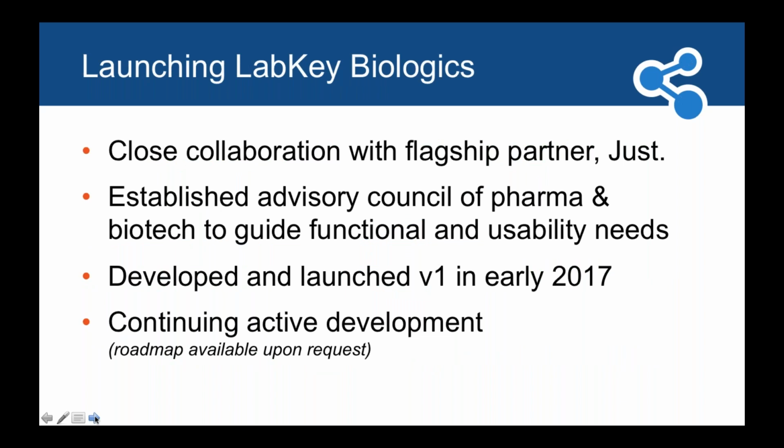So more specifically, in terms of how we built this with Just Biotherapeutics, we've been working with them for over 2 years now, and they were really our flagship partner in defining what those requirements were. But we also know that we were building a product for a much broader audience than a single biotech. And so we established an advisory council of pharma and biotech companies to guide the functional and usability needs. So this is a formal product advisory council that we meet with every single month to get feedback on initial designs, what we've built, what our plans are.